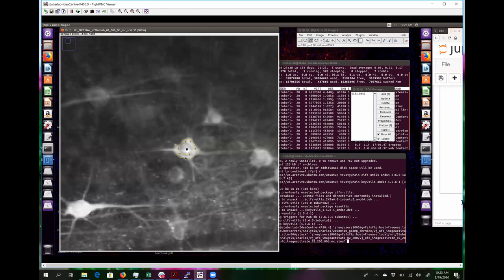The cell, the cytoplasm. And this is the key thing here: your imaging preparation determines the level of caution you want to apply. If your imaging preparation is very good in terms of resolution, like your surface cortical imaging with very high NA objectives, then your resolution will be very high, both in XY and in Z. So now if you have any motion, you're going to be super sensitive to that. In those cases, you'll have to be pretty much 100% confident that there is no motion.